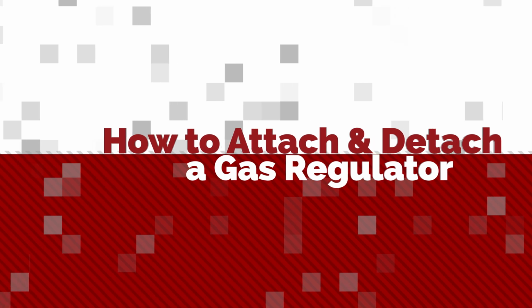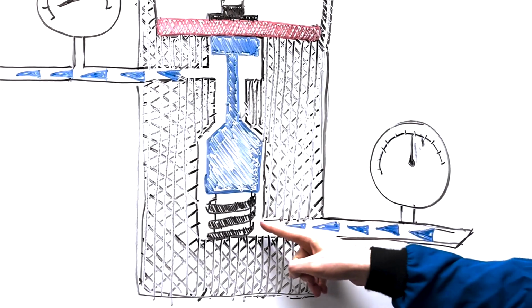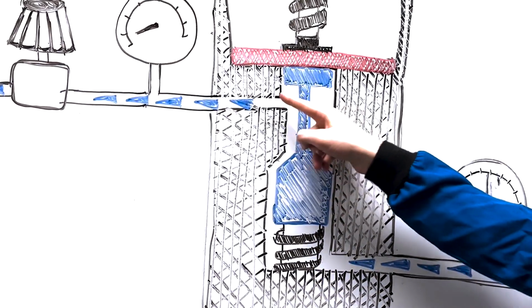This second video covers how to safely attach and detach a regulator. Be sure you have watched our first video to fully understand how a regulator works before watching this one.